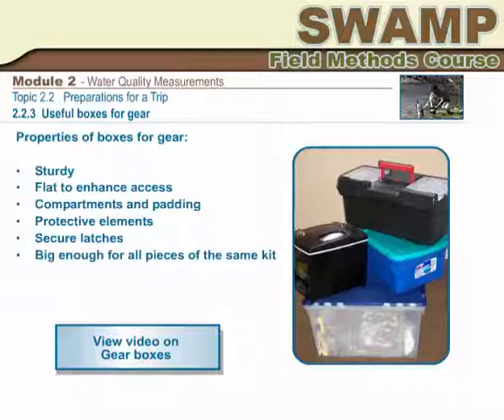Make sure you know how to pack and stow gear to avoid damage by static electricity, water, dust, vibration, and so on. Choose boxes that are sturdy, easy to lock, and well padded, but do not get boxes that are too heavy for one person to handle when full, because we know someone will eventually try to lift it.